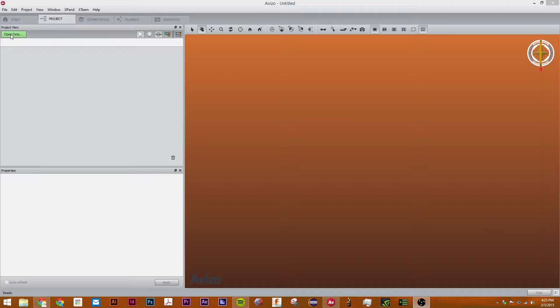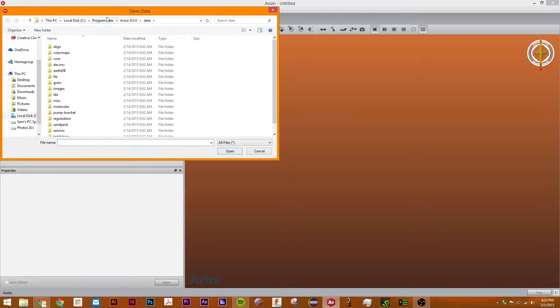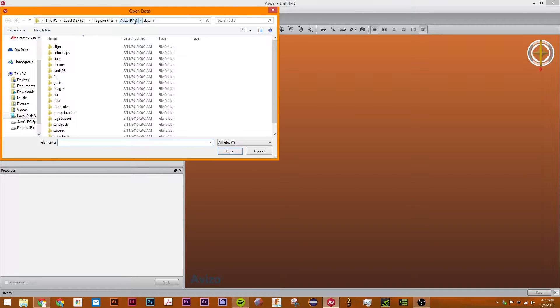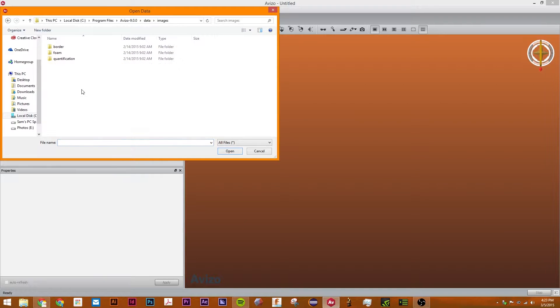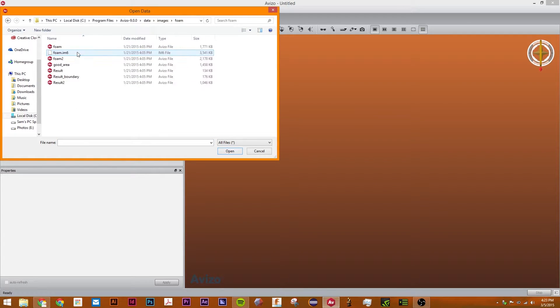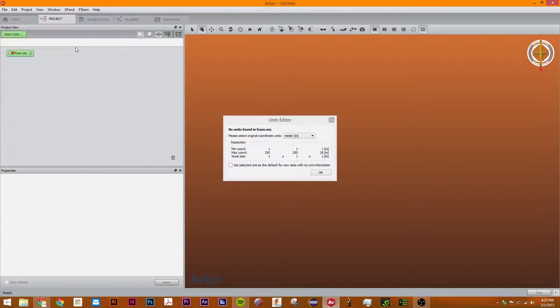The first thing we're going to do is click on open data and go to Avizo 9.0 data and then go to images. We're going to go to foam and just click on the first one.